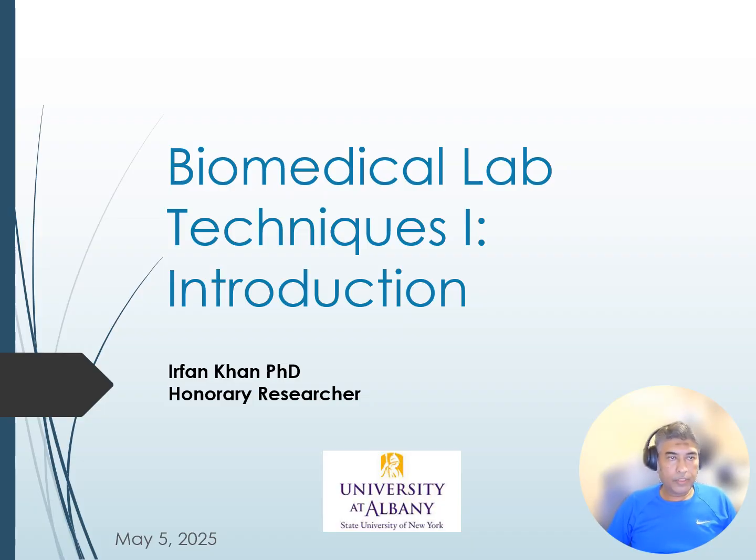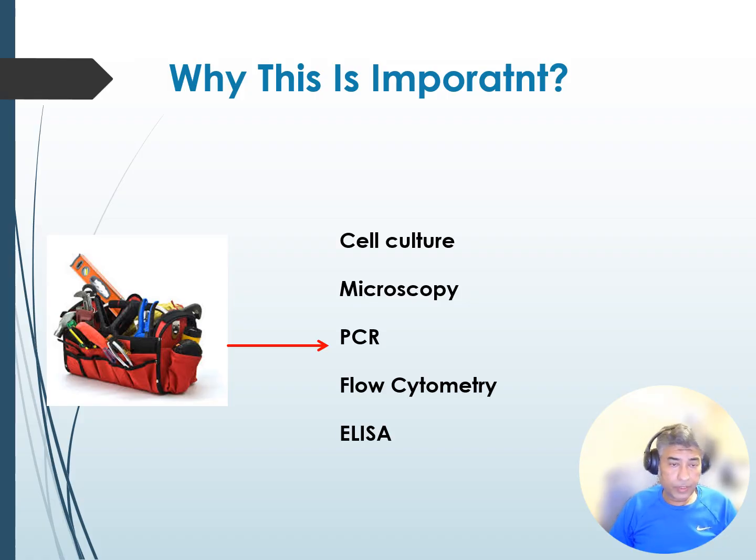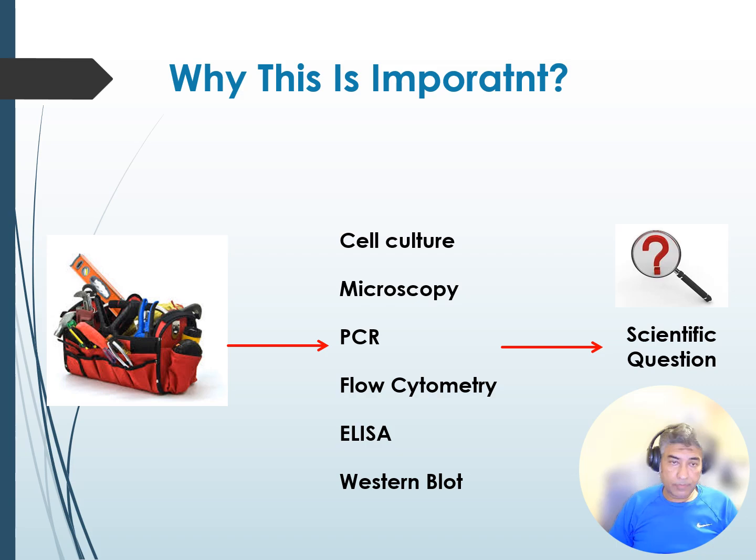So, our topic today is Biomedical Lab Techniques 1: Introduction. Why is this important? Because in upcoming lectures we have to learn cell culture, microscopy, PCR, flow cytometry, ELISA, and Western blot. And all of these techniques need a scientific question.